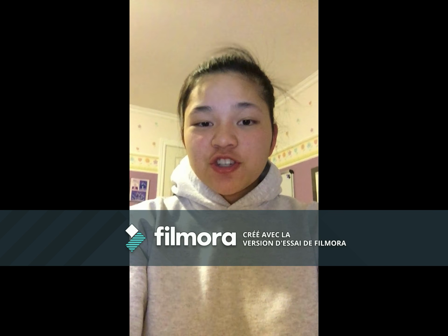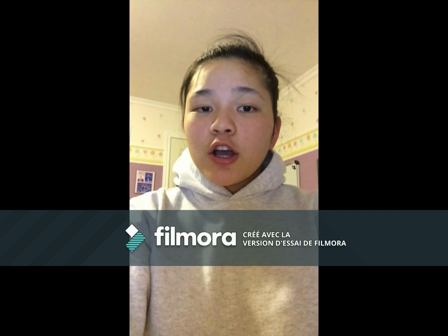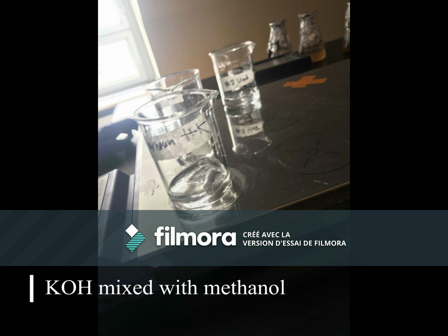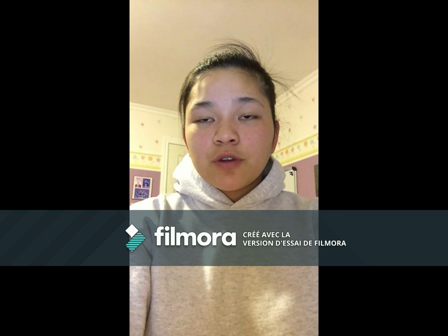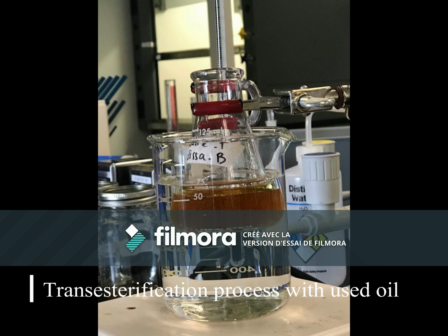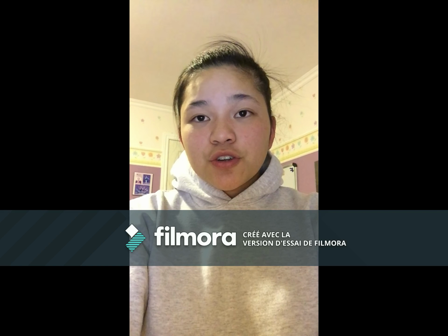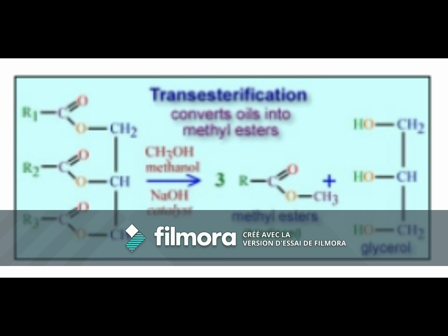Today we perform a transesterification reaction by mixing methanol, a short-chain alcohol, and KOH, a catalyst. And then by making the mixture react with used oil and virgin soybean oil. The transesterification will convert the oil into methyl ester, the main component of biodiesel, and glycerol.